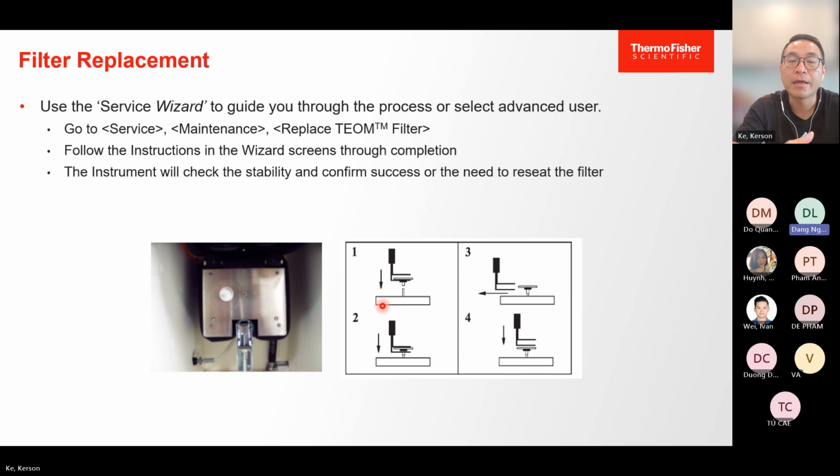Is it easy to replace the filter? I would say you need a bit of experience, because the adapter here is quite small, so you must have a very skillful hand. So we have to train the client so they can do it by themselves.